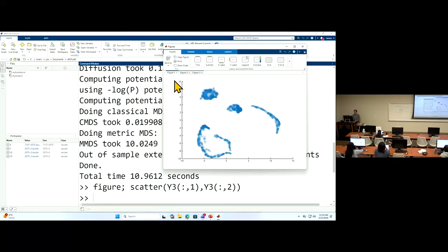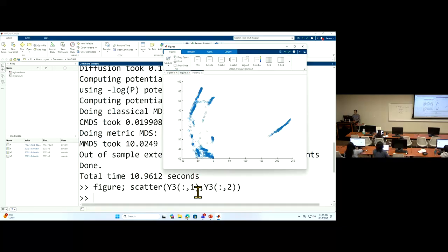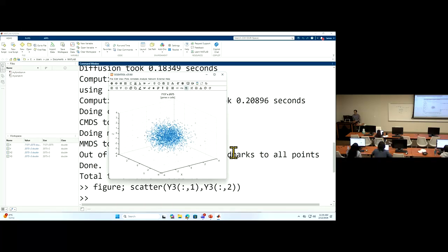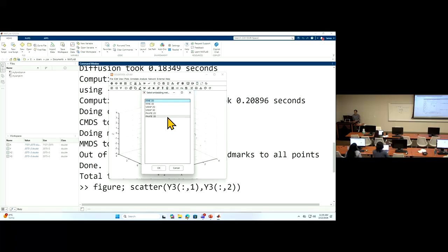I don't know if you get this, but you can come back to the interface, so you don't have to type those command lines. Now you can have this data in there, and then we decide to do the embeddings. We can click these buttons. If you want to do them all, you can use Shift to select them all.